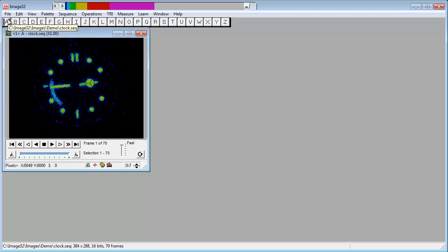Now obviously we've only got buffers A to Z, which is a total of 26 buffers, so anything after image 25 in this case isn't loaded.